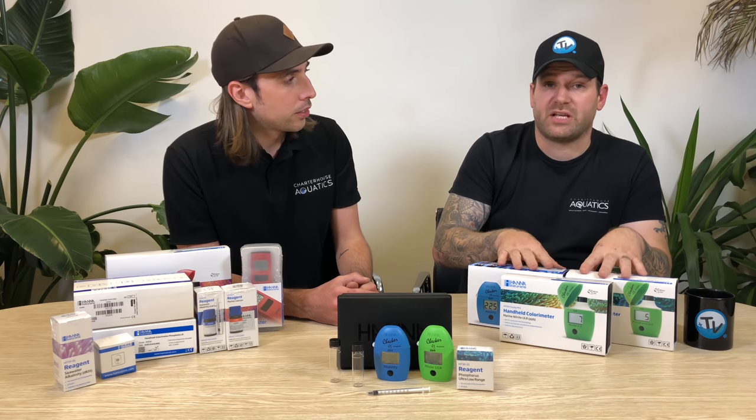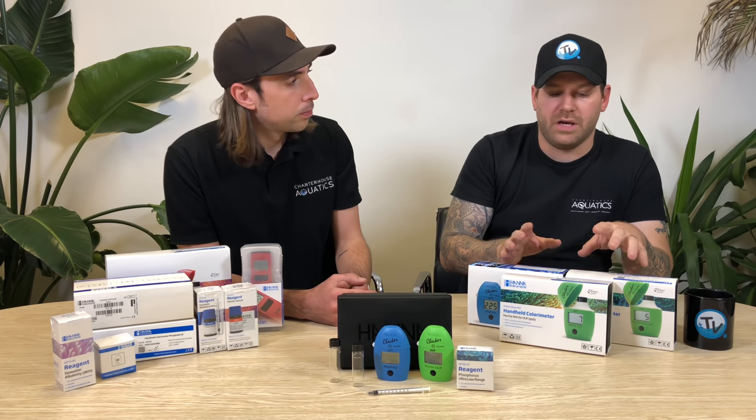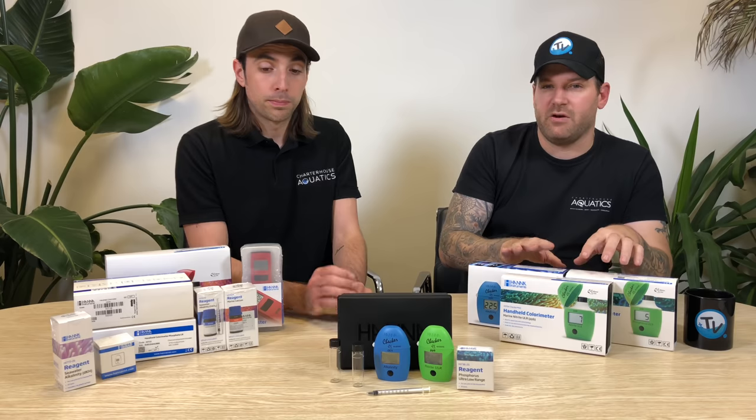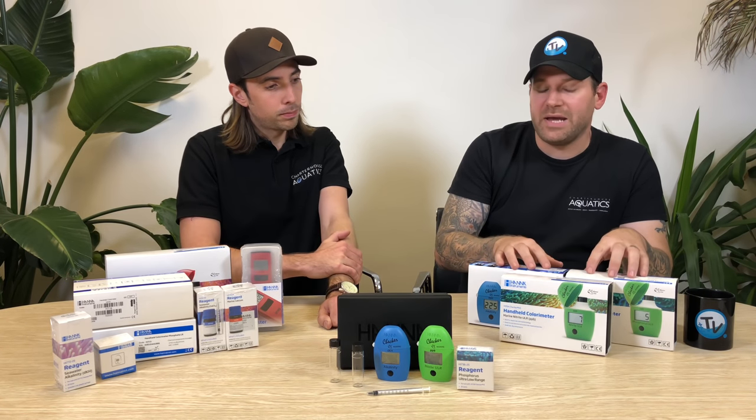Some of the most popular digital checkers on the market are made by Hanna Instruments. Hanna have been around since the 70s and they're a leader in the field of water testing. They've made a complete range of testers for the aquarium industry.